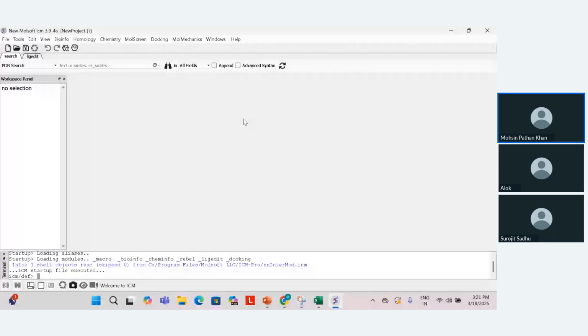So first of all, if you want to perform ligand modification or ligand design optimization by using the ICM 3D Ligand Editor, you need your ligand molecule and the protein in complex form. That complex can either be an experimental structure, or a complex obtained by a docking study. The complex we are using here is 1-UNL, an experimental crystal structure of the protein complex with the ligand molecule.